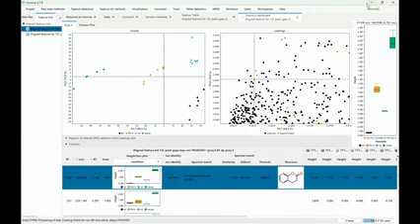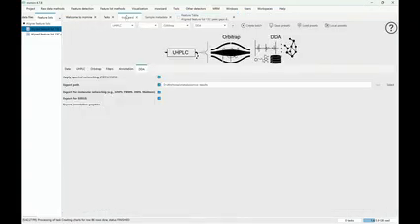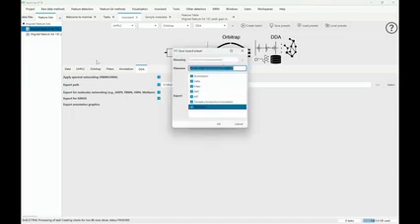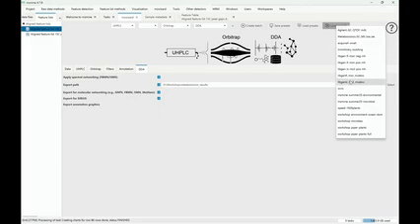And then from here, we could now also just go back to the wizard, and we could basically do any kind of processing and go on, right? I want to highlight, you have to save some of the parameters. So if you've optimized your wizard now, I would always go and save preset. I just type in a name and click OK. Here the directory is the default directory of mzmine. So if you put mzwizard files there, we're going to pick them up, and you're going to be able to find them here, and you can basically just mix and match and say my 10-minute gradient with the Orbitrap.